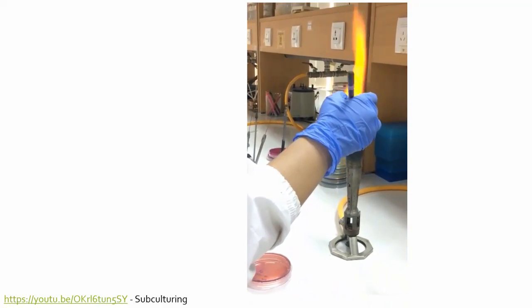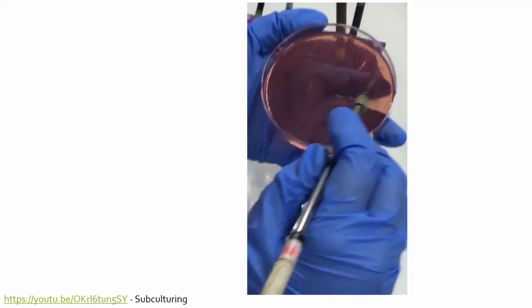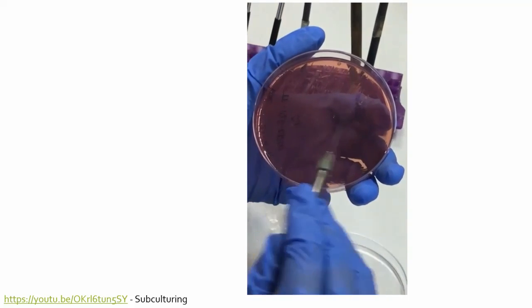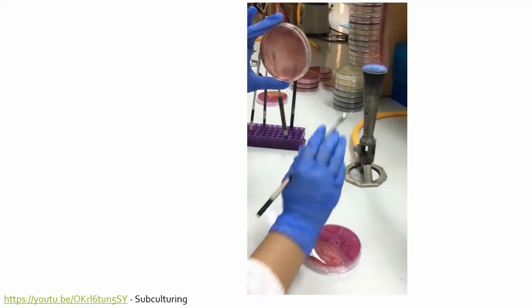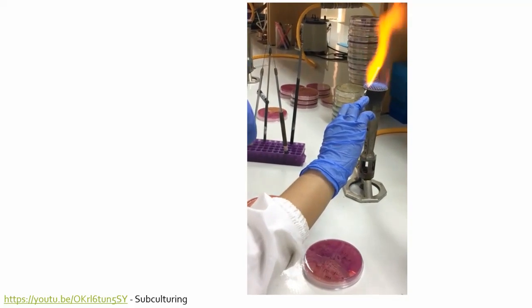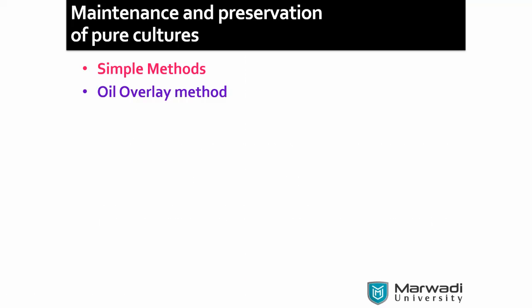It is just subculturing from one place to another. So what they are doing, they are using another loop, so one has no need to wait for the loop to get sterilized and cooled down. So how many times is the streaking? Fine.